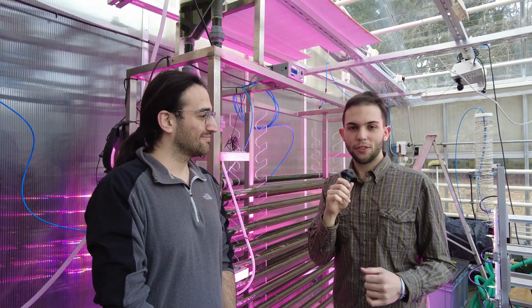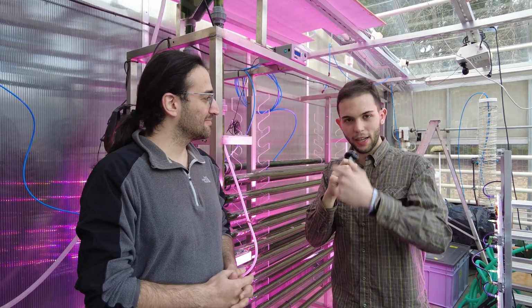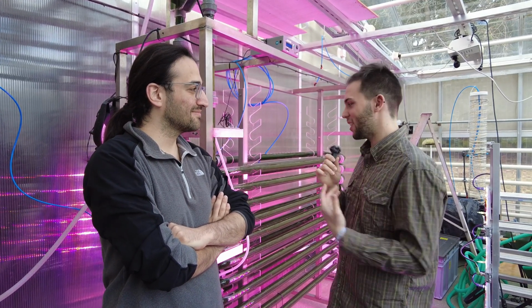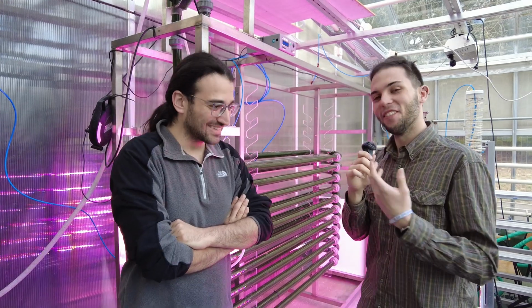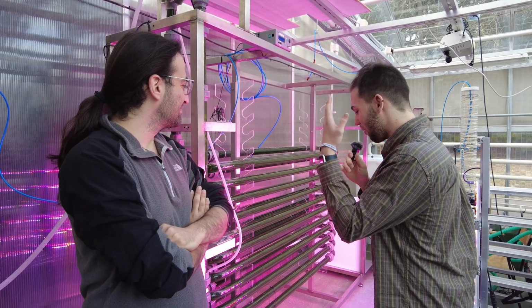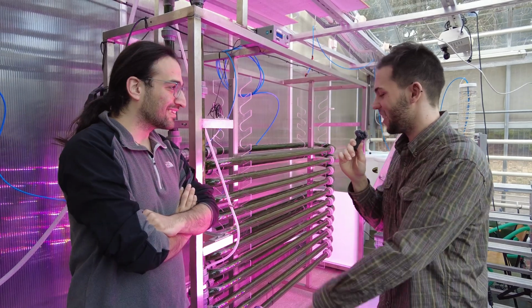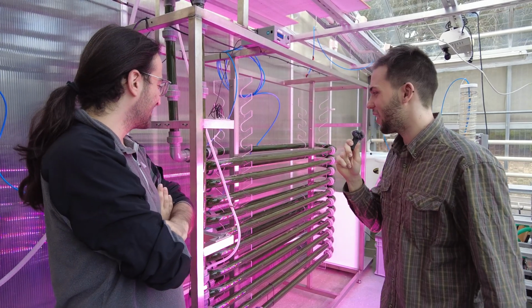Well, that's very interesting. So the idea is to have this combined agricultural wastewater treatment, so we can have a greener agriculture, greener in every sense, because the algae is also green. But that's very cool. So this looks very cool. What is that? There's a bioreactor, but can you explain what it is doing exactly?